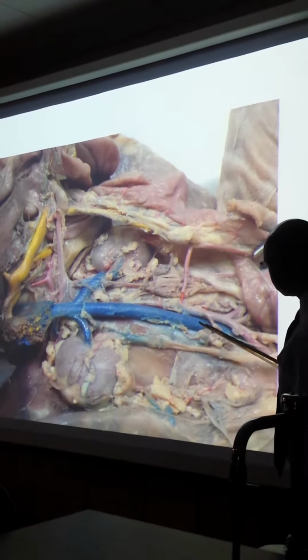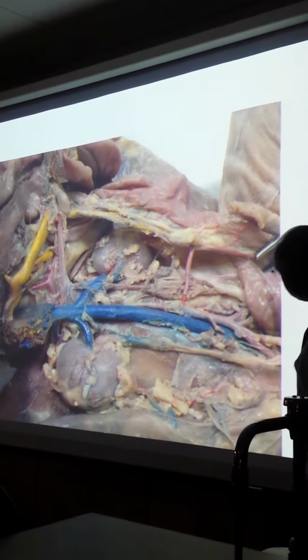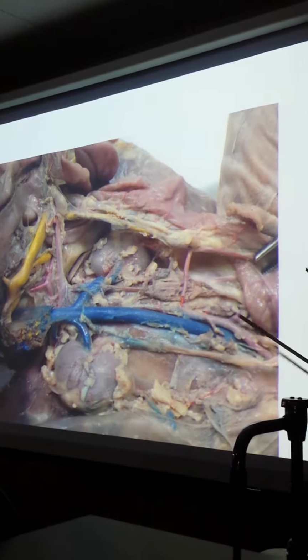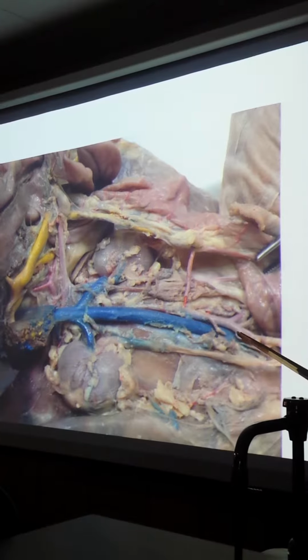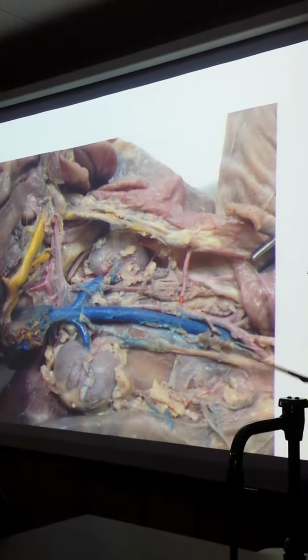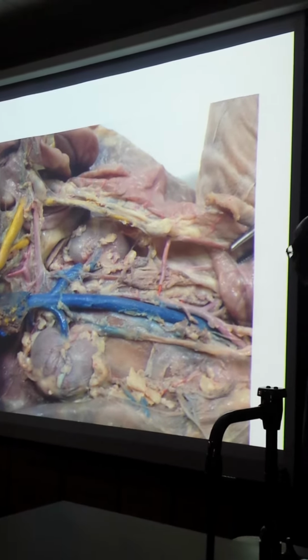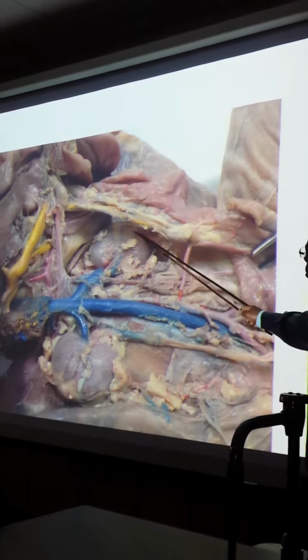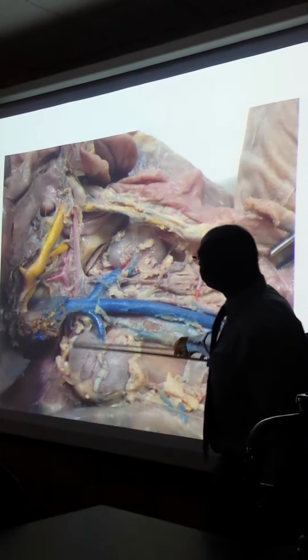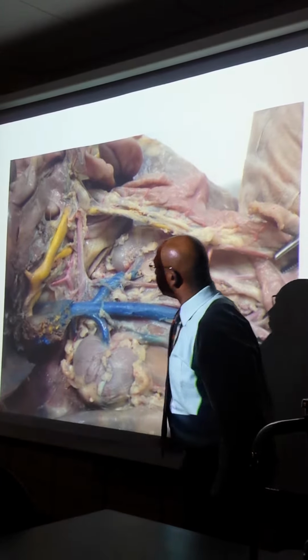But this is, it's somewhere here, this is the iliolumbar artery that you can see, and of course the external iliac artery and common iliac vein. But there's a better picture where it shows this down a little bit more, later on. But we got most of those, and of course this is the inferior mesenteric vein, and superior mesenteric vein, gastrosplenic, and then of course the hepatic portal.